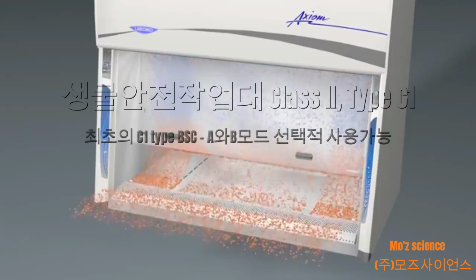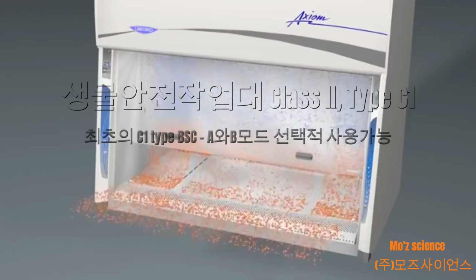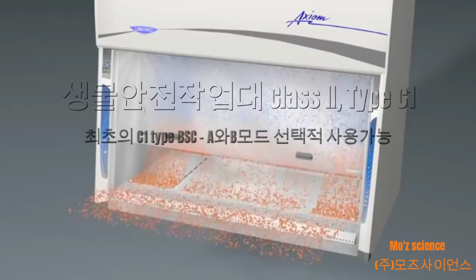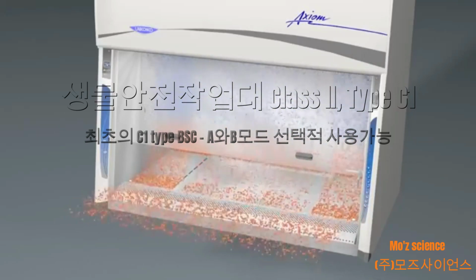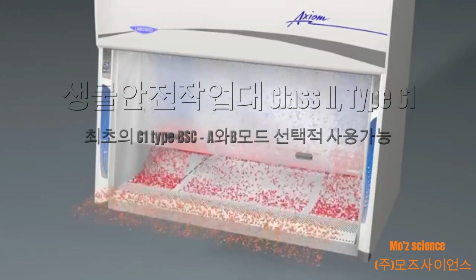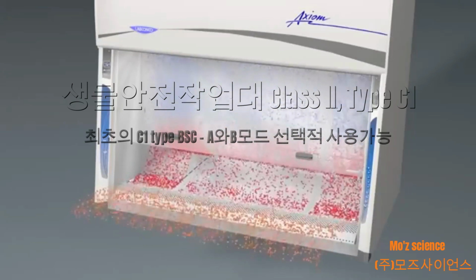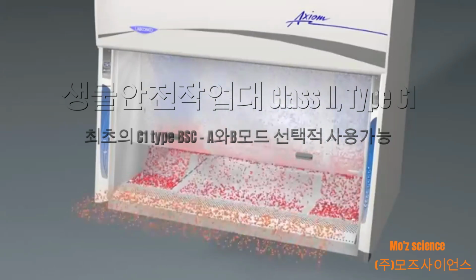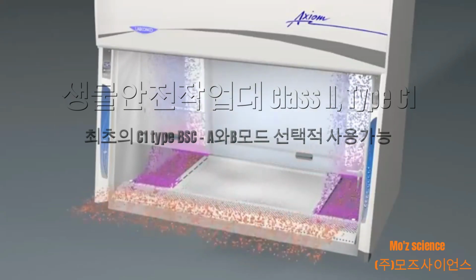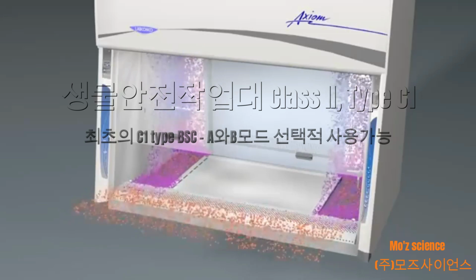Above the working area, the air is positively pressurized and is measured as downflow by the certifier to meet NSF ANSI Standard 49 requirements. Air at working height should be considered contaminated by the work being performed and is now drawn under the work surface by negative pressure. Air above the wings of the 3-piece work surface mixes with incoming air and is recirculated back into the supply airflow system.